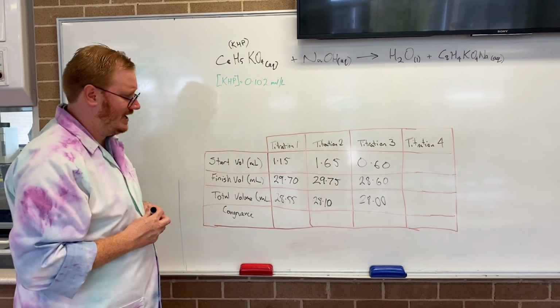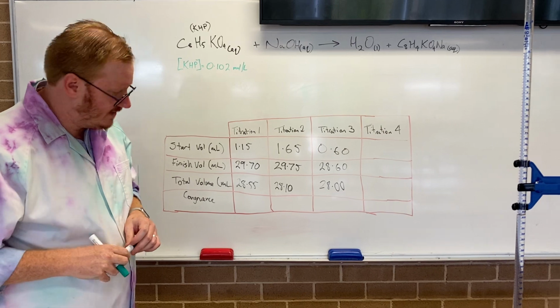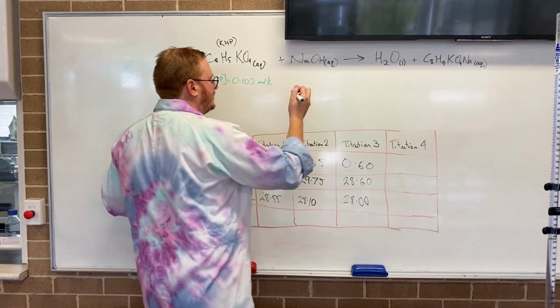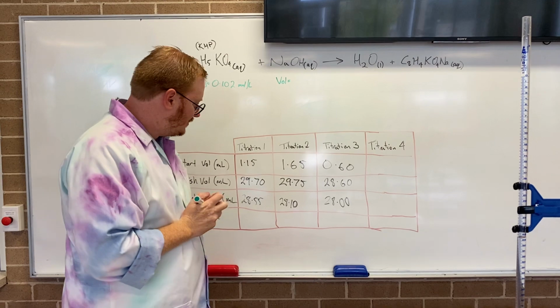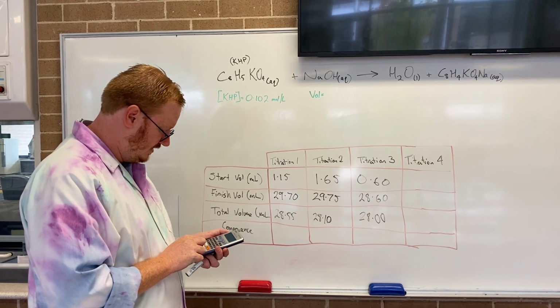Okay, doing our calculations, I'm just trying to work out where we should do it, add some more information in. We can now work out an average titration volume of our sodium hydroxide. So it's the average between those 3 numbers. We can't eliminate the first one. I've got to use it, it's a valid piece of data.